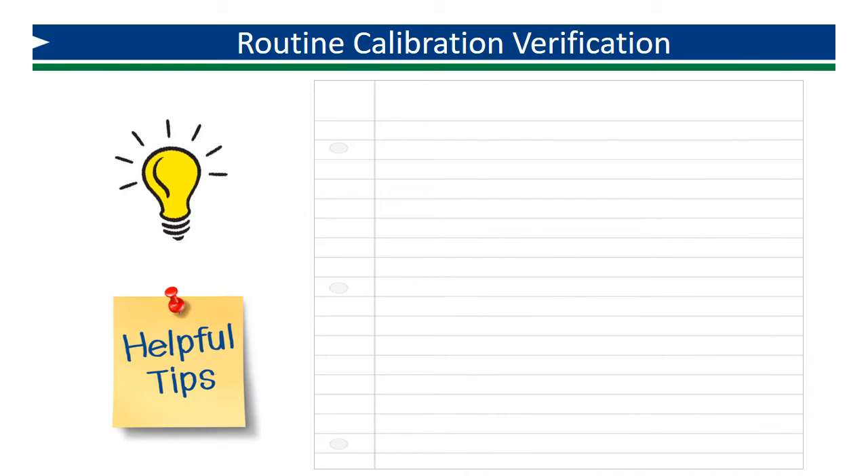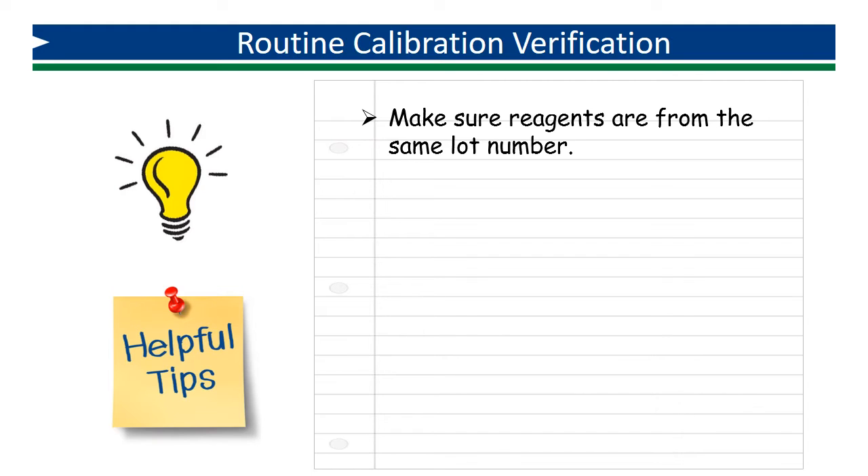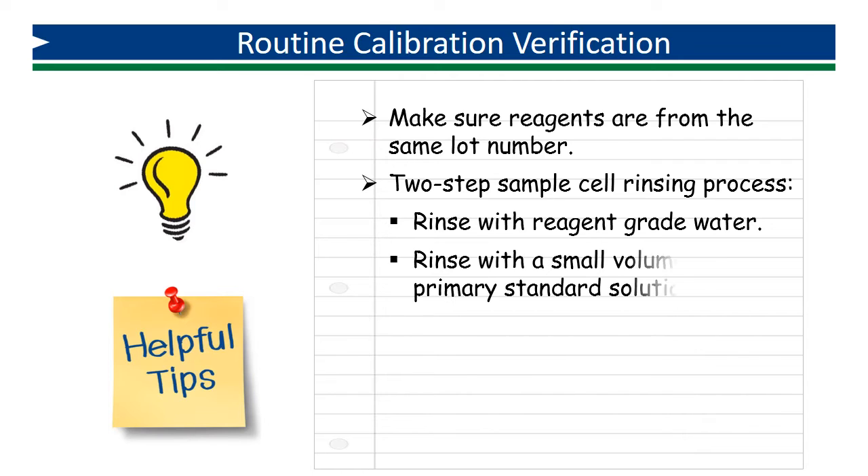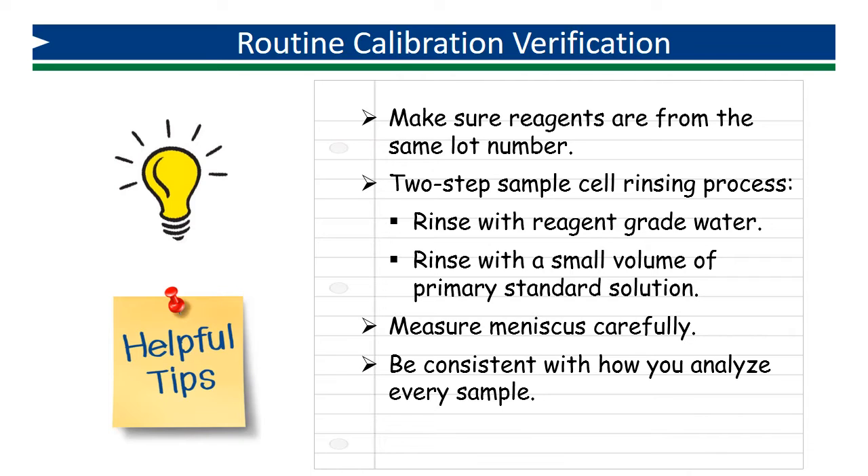Here are a few tips to help you eliminate sources of error. Make sure all reagents are from the same lot, so they are all designed for the same sample size and have the same degree of interference. Use a two-step rinsing process between analyses: first, thoroughly rinse your sample cell with distilled water to remove all traces of residual reagent, then rinse it again with a small volume of prepared standard to displace the remaining distilled water. This will eliminate any unwanted dilution of the standard being analyzed. Measure your meniscus carefully and be consistent with how you analyze each sample.